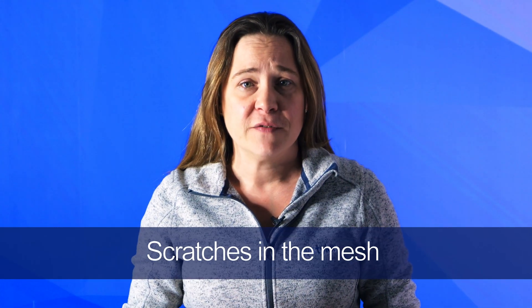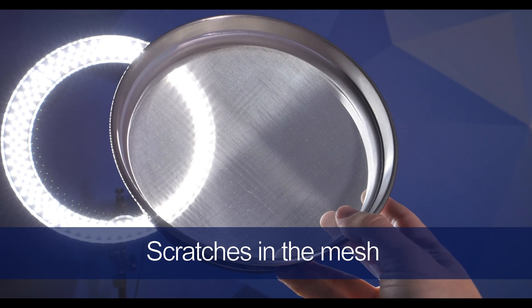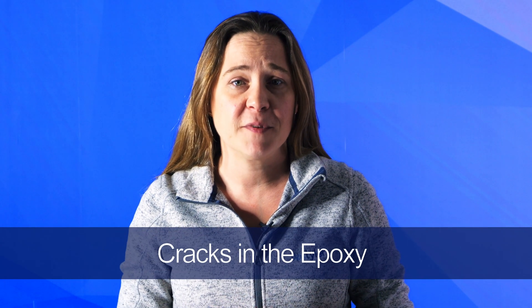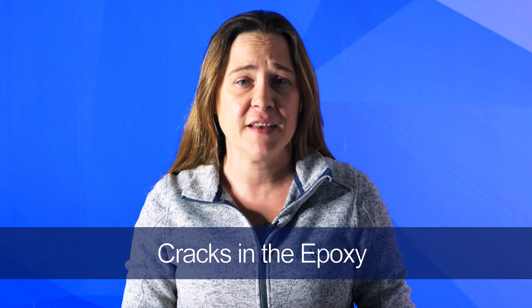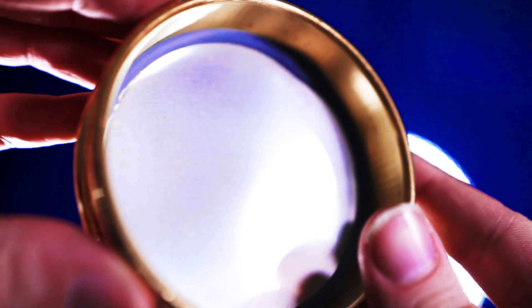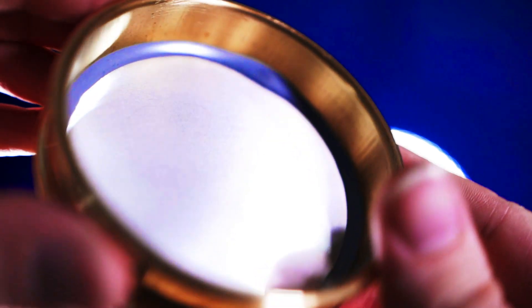Just like with dents in the mesh, visually inspecting your sieves for scratches is also important. Scratches can cause tears or rips in the mesh, which can alter your sieve analysis. The epoxy is the gray substance used to hold the mesh of the sieve onto the frame. You should check the edges of the sieve where the mesh meets the metal frame and make sure there are no cracks. If cracks occur, it can allow more particles to pass through the mesh than are supposed to, which will skew your testing results.